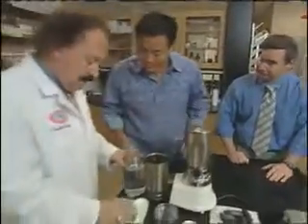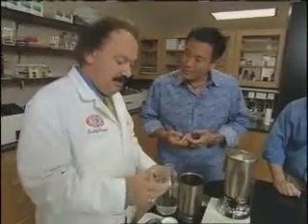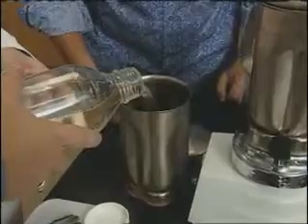All right, so what do you test for, Stephen? Impurities, bacteria that's not supposed to be there. Okay. And definitely what I do is I just shuck the mussels. I put them in a blender like this. I add some sterilized water. Okay. And then I put them on the blender stand, and I'll blend them for a minute.